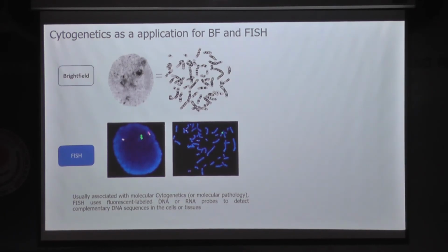If I am interested to study the parts of a chromosome, first of all, chromosomes are very small, but with the help of better microscopy we can see the metaphases, we can see the chromosomes. But again, if we need to hunt for more details in those chromosomes with naked eyes or with microscopes, it is difficult. So molecular probes are available which can directly hit the centromere, telomere, or whatever area of interest you are looking for. They get attached to that, and with the help of a fluorescence microscope we can hunt for them.